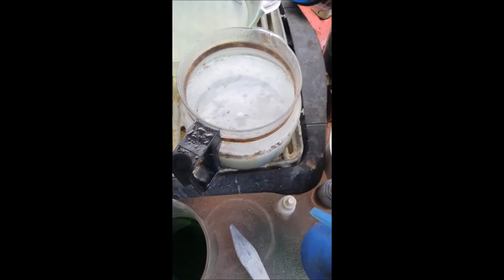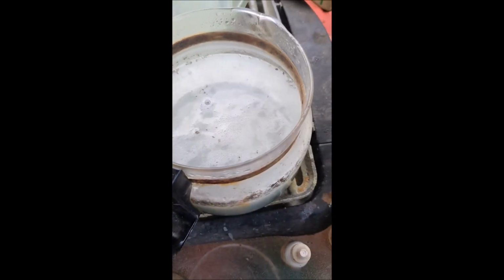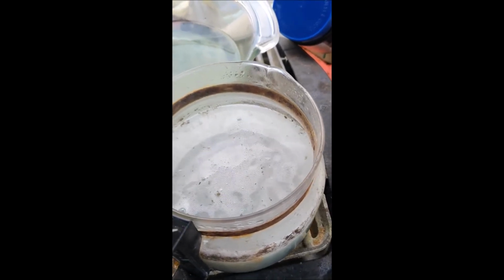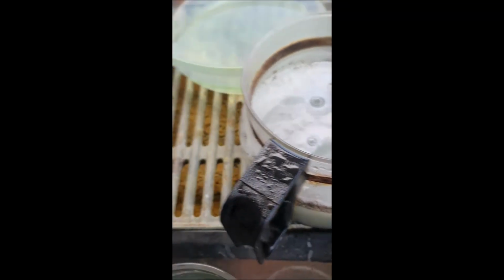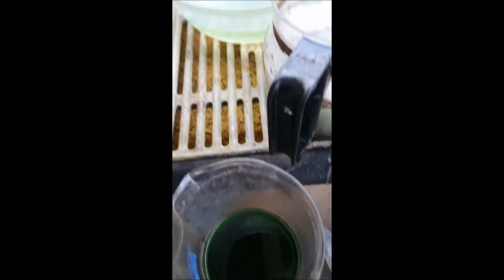Well, it's been half an hour and you can see the metal breaking down. Looks like thousands of little ants in there. But that's what we want. We want the metal to be consumed and making iron sulfate. I've got some foils happening over here. There's a little bit of powder settling down there.